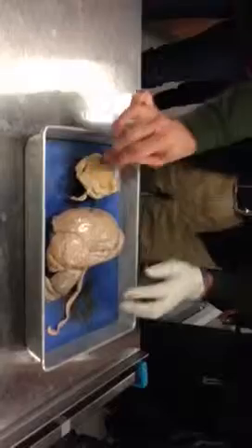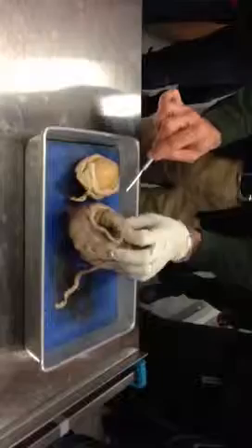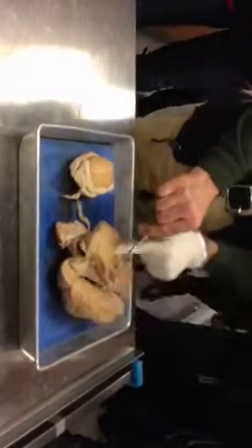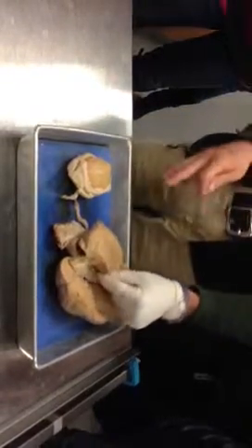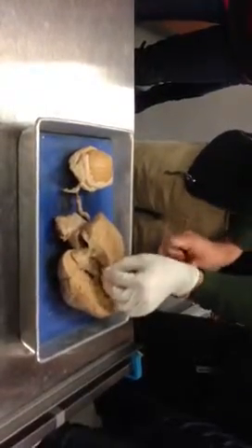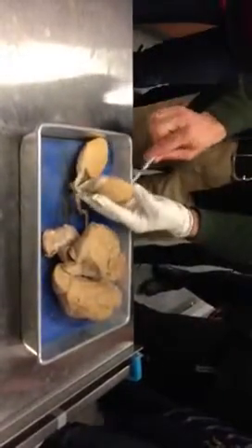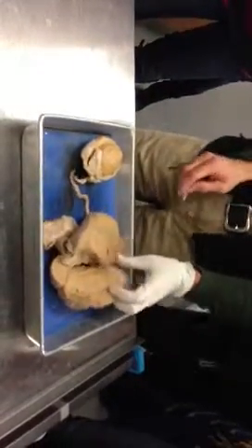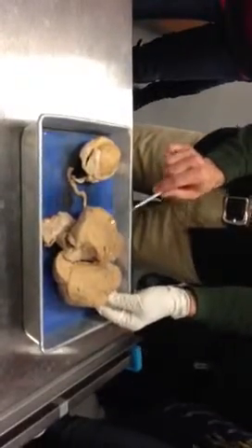Okay, the outermost layer of the testis right here is the tunica albuginea, and we can see that when we open it up a little bit. This layer here. Oh, there we go. It was peeled off somewhere. Okay, so this was the tunica albuginea. It's a very heavy-duty, outer connective tissue layer. It holds all those seminiferous tubules together. It's here, but it's shown much better on the bull testis. Then inside of the testis, all of this spongy orange tissue is the seminiferous tubules.